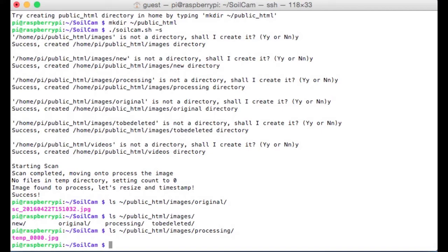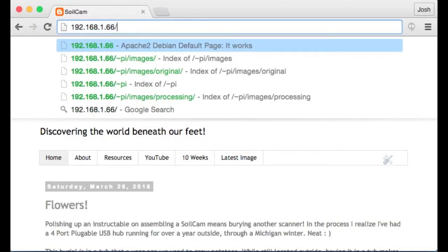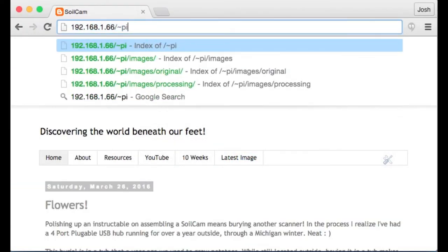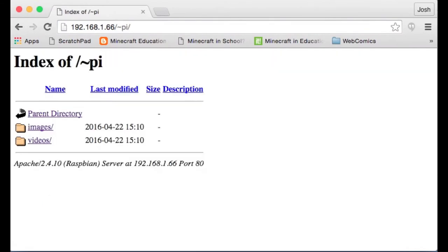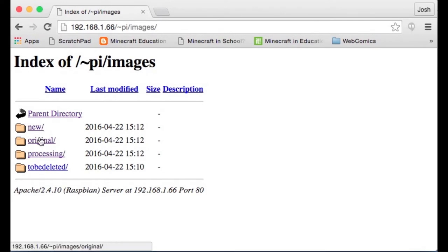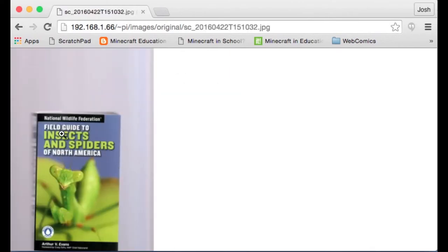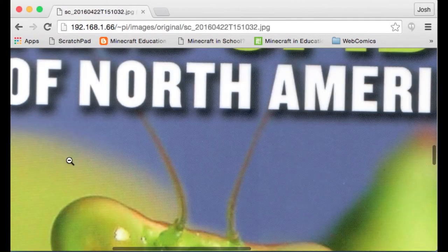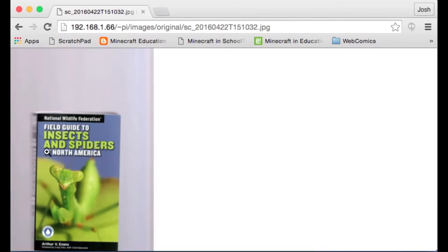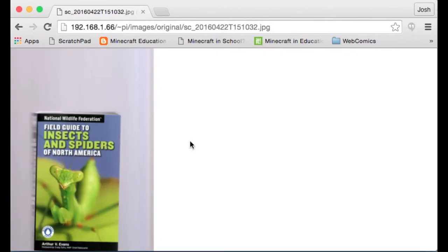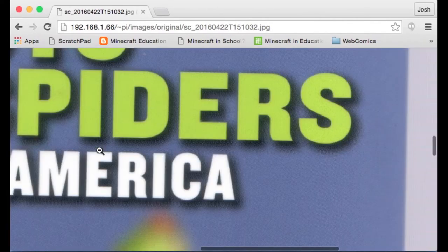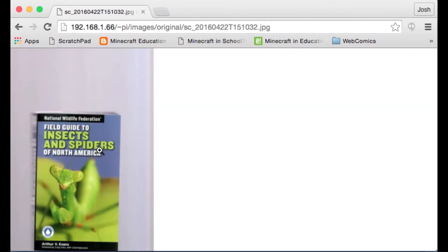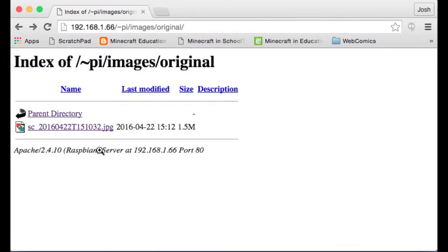So the other way to view this is via the web. If I type in the address of my pi and go to forward slash pi, we now have an images directory and a videos directory. If I click on images and I go to original, we can see that original image time stamped and dated. Looks like that came out alright. One thing you'll notice with these cheaper scanners is they really can't scan anything more than about a millimeter or two away from them. So really only stuff that is right up against the glass platen will be viewable.